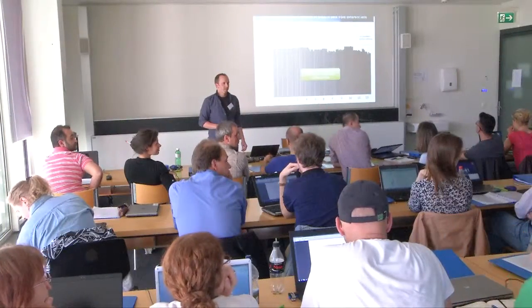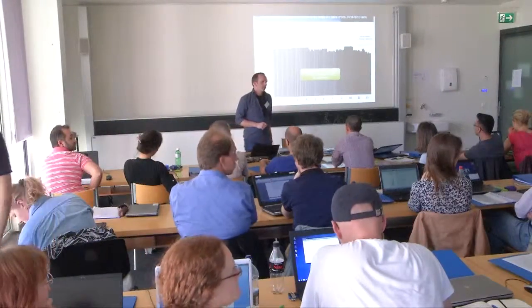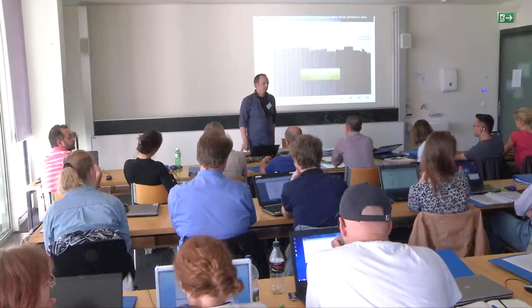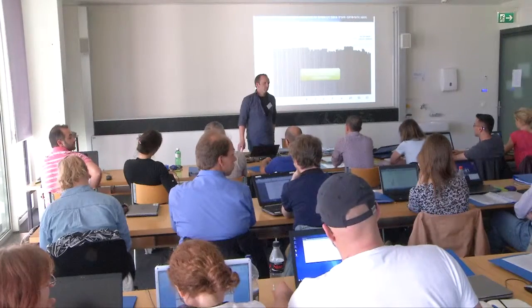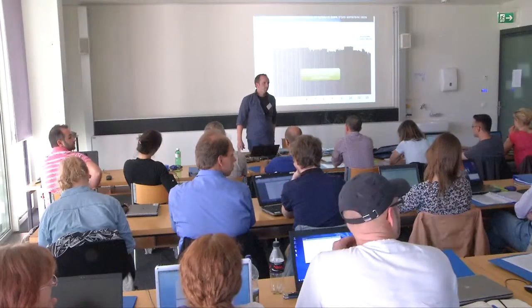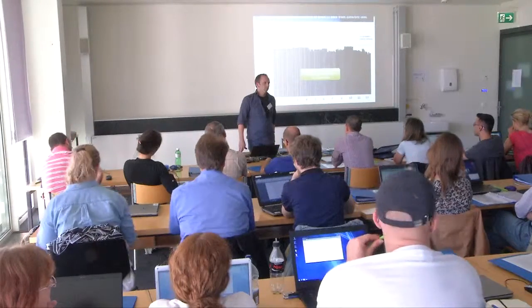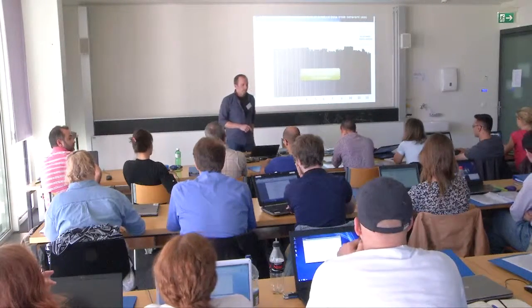Since you are fragmenting everything coming into the mass spec, for sure the energy you are applying will reflect what you will obtain on your peaks. And how do you manage the energy? Because if you change parameters, for sure you will not have the same thing, and even when you are trying to quantify, you will not have the same intensity. So you're talking about collision energy? Yeah. Okay, so that's a very good question.